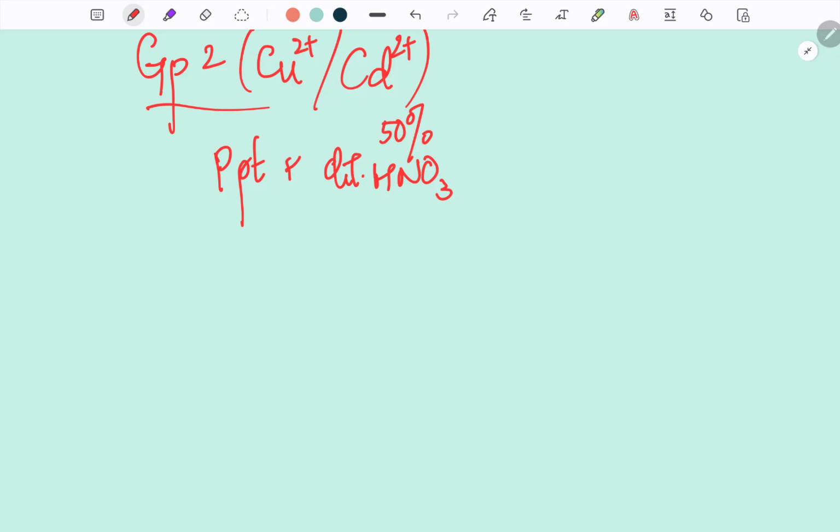But in your lab, if you're just having dilute nitric acid, then you can just use that. Or what I would recommend is, if you don't have 50% dilute nitric acid, you can very well use just dilute nitric acid. Sorry, I had to pause the recording in between.